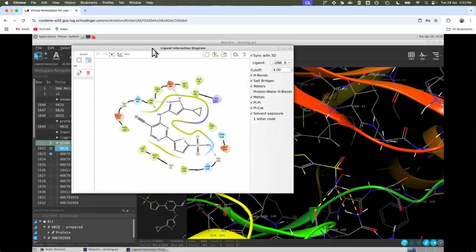Yeah, I'm getting a different image. Who is having a problem? I'm getting a different diagram, not a similar diagram. Okay, so I'll just stop. Is it possible to share your screen? Yeah, sure. I'll stop sharing and you please share your screen.